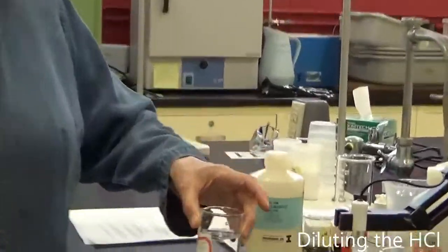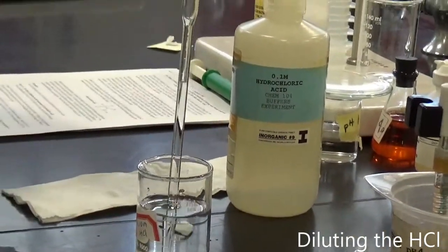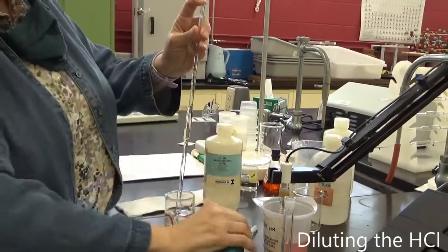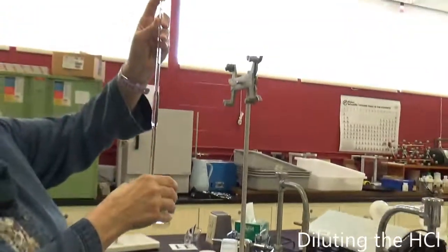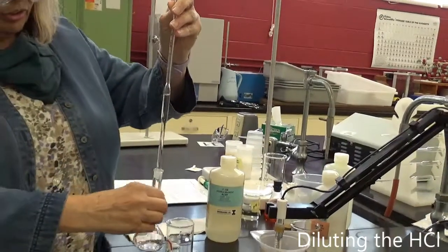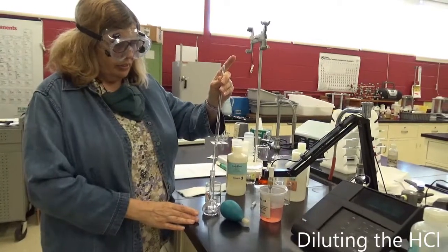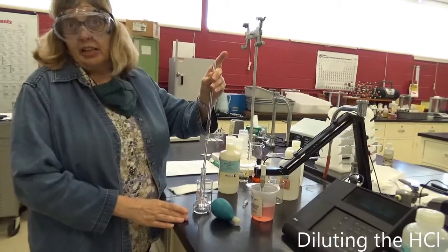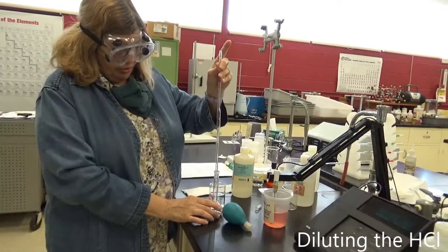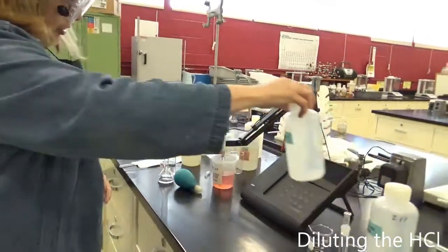Hi, so I'm going to do the serial dilution. So we have some 10th molar HCl in this flask, and I'm going to pipette 5 milliliters of it. Hold it up to eye level. There we go. Into this 50 milliliter volumetric flask. You'll notice that I had a 5 milliliter pipette and a 50 milliliter flask, so you can figure that that is a factor of 10, a tenfold dilution, because eventually I will add water to this. Okay, so that's 5 milliliters placed in a 50 milliliter volumetric flask.